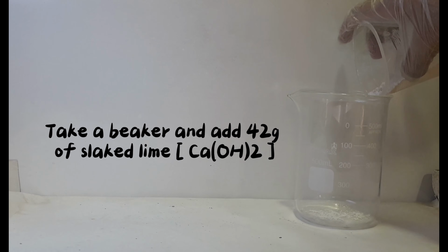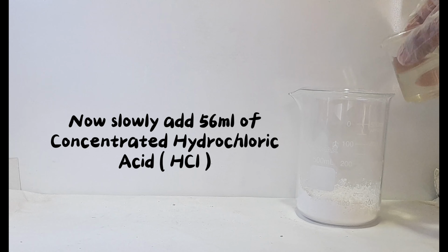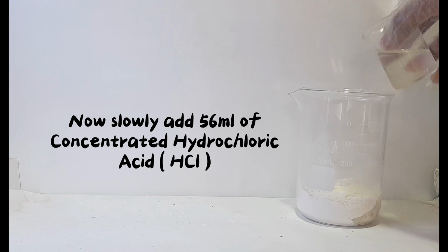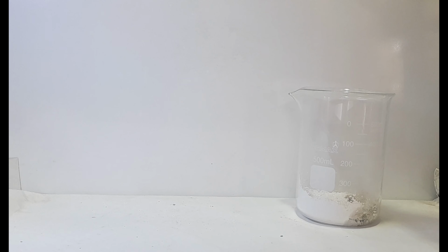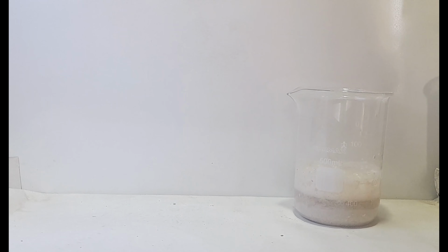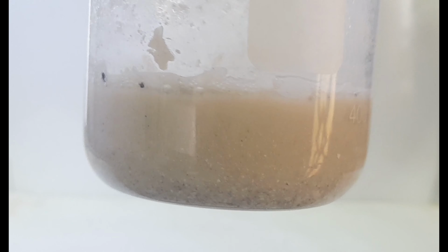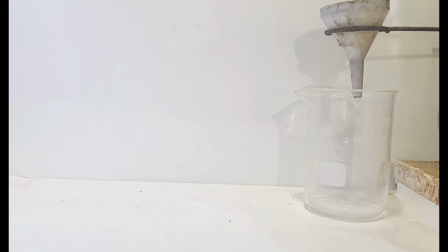Start by adding 42 grams of slaked lime in the beaker. Then add 56 milliliters of concentrated hydrochloric acid slowly in it. Now filter the solution to remove unreacted substances.